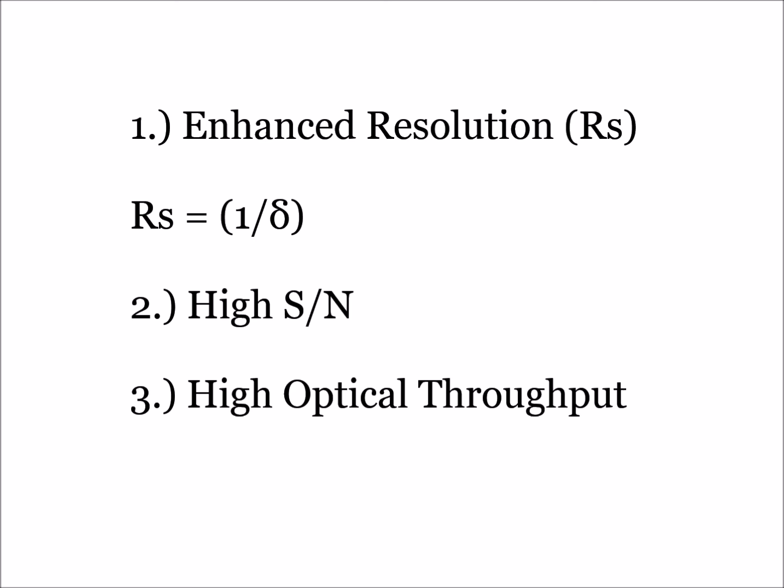Two other major advantages of utilizing FTIR spectroscopy include the improved signal-to-noise ratios and high optical throughputs, both of which are useful for detecting samples with either high absorbance or weak signals. Other advantages include very fast scan times, the lack of a requirement for external calibration, and the fact that the technique is non-destructive. The only significant disadvantage of FTIR spectroscopy is that the instrumentation is more expensive than dispersive IR spectrophotometers.